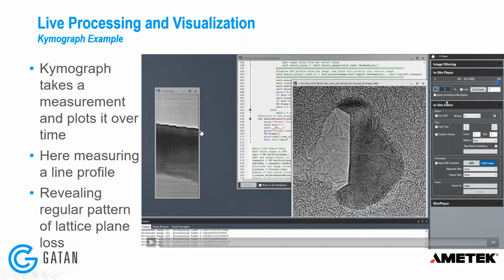And from the result here, I can see not only is the movement of this lattice plane quantized, it moves rapidly at a specific time, not gradually, but also, and this was a bit surprising to me, it's relatively uniform, the frequency at which this happens. And this is something that I never noticed, even after watching this video many, many times. But it's very easy to see after processing the data.